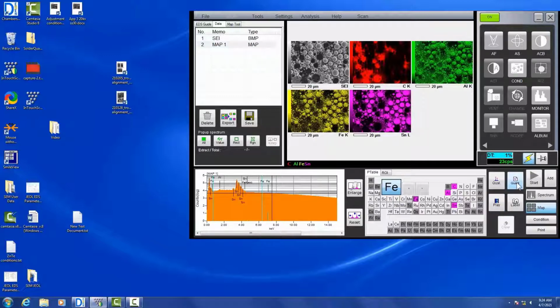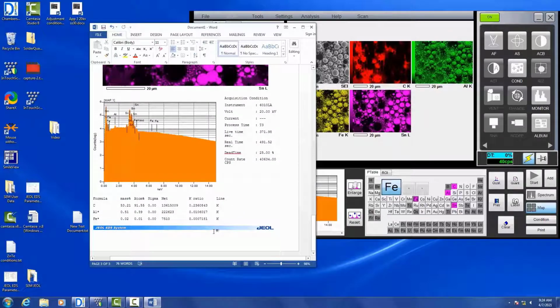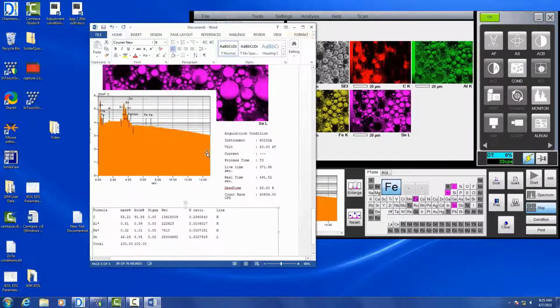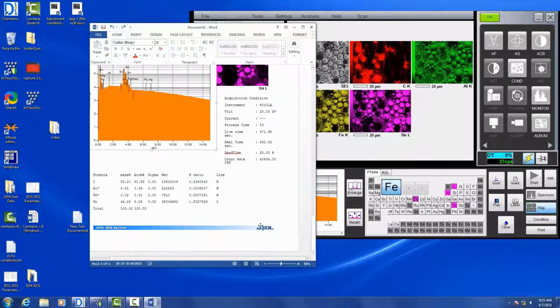Now I did notice on that one, tin wasn't shown on the list. So I'm going to redo the report and look, and I notice tin isn't there again. So this is something you're going to have to look out for when you're doing these reports of multiple elements. The way it lays it out, they are sometimes hidden. So I'm going to move that graph up, and I'm going to move my data bar up and expand it, and now I see my tin and my totals. So just be aware that if you have multiple elements in this with your images, if it's going to cut off close to the bottom of the page, you're going to have to actually move that table of data so you can expand it to see the total.